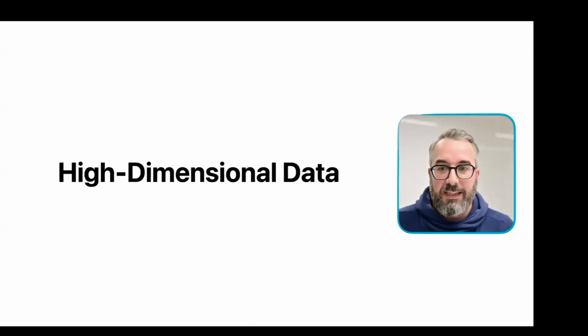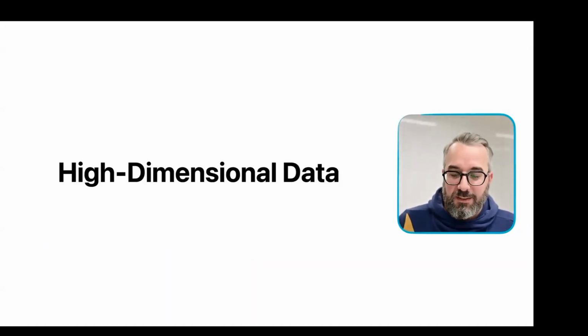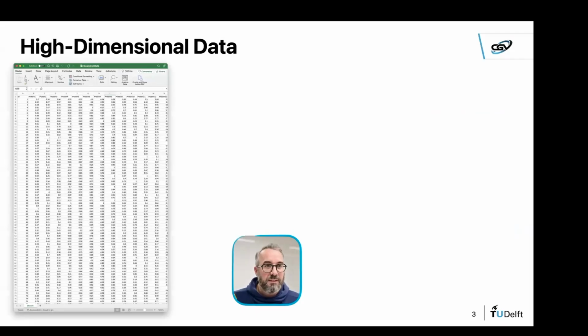So I guess I don't have to introduce much, but high-dimensional data, right? Until not so long ago, when we thought about high-dimensional data, we were mostly thinking of tabular, abstract data, where, for example, what I have here on the slides is a single cell table, where every row is a cell, and then we have protein measurements. Every column is one of these proteins. Could be genes also. So we get these huge tables with many rows and many columns.